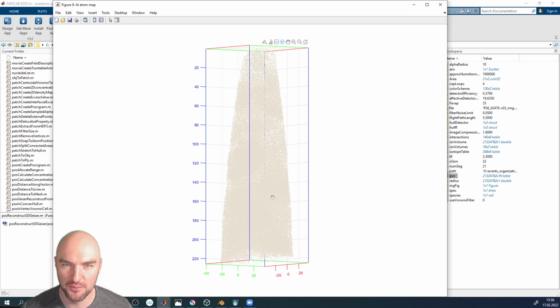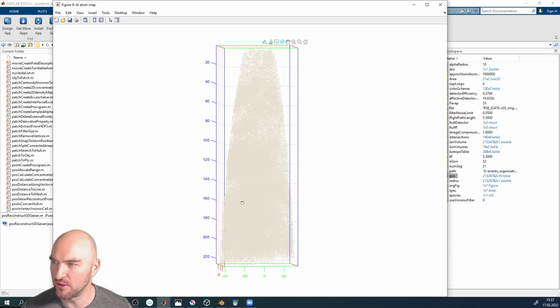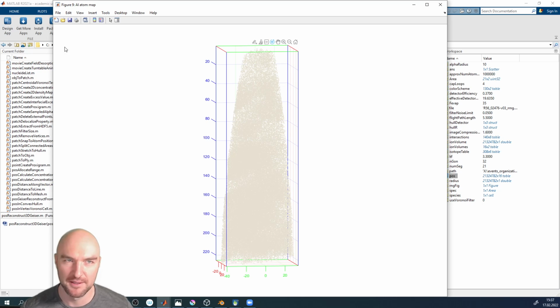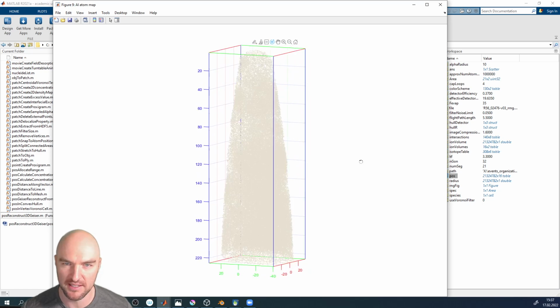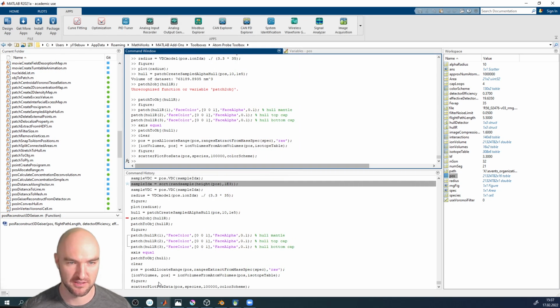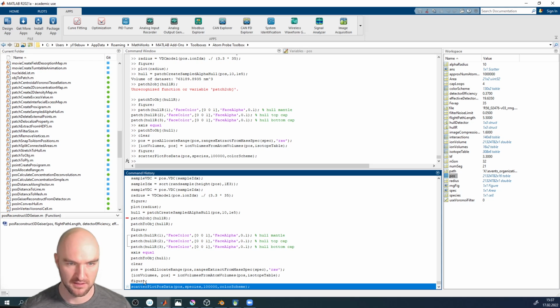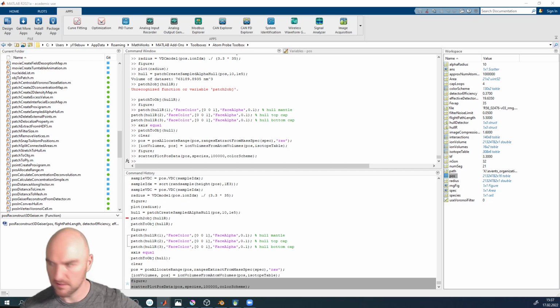Anyway, it's a nice superalloy sample. You can see we've got some nice precipitates in there. Yeah, so this is actually pretty cool for our purposes. But what we don't necessarily know is whether they actually look the way they should look. Yeah, and maybe we can just work on making them look the way they should look. Okay, so I'll just copy that into the chat.